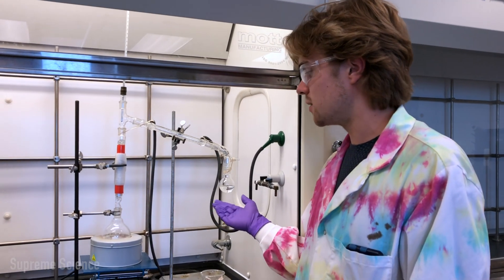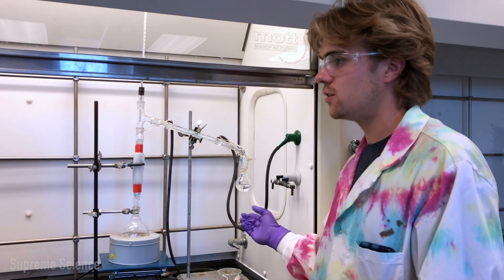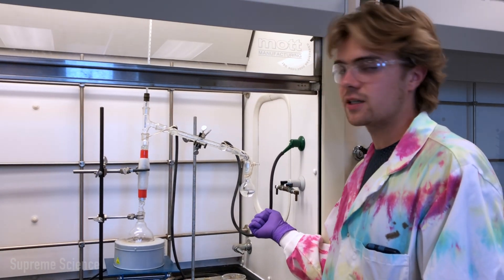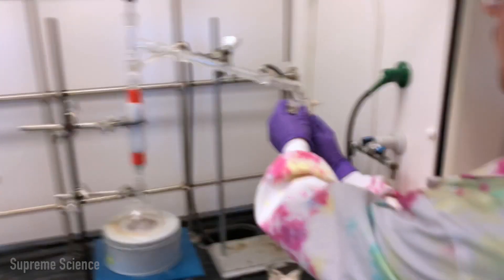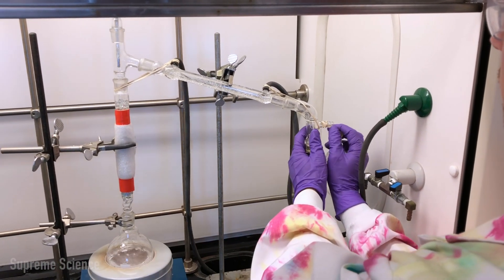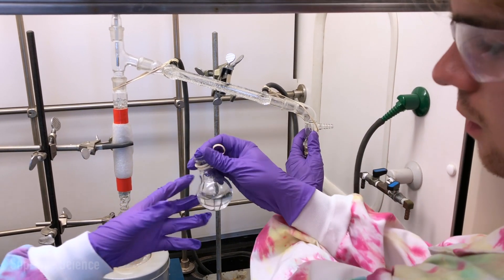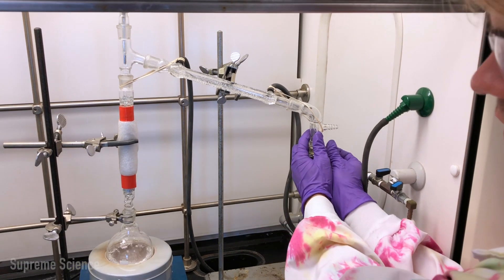Now we have our ethanol collecting in our receiving flask and we're almost ready to switch to fill our next fraction. Very quickly remove our old receiving flask and put the new one on, and we can put that in a beaker.